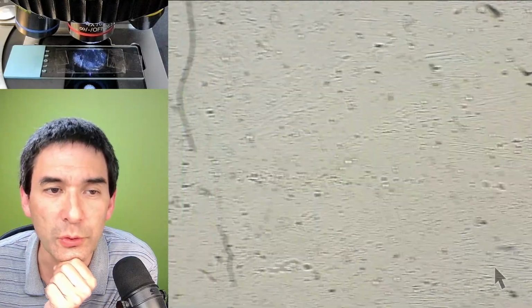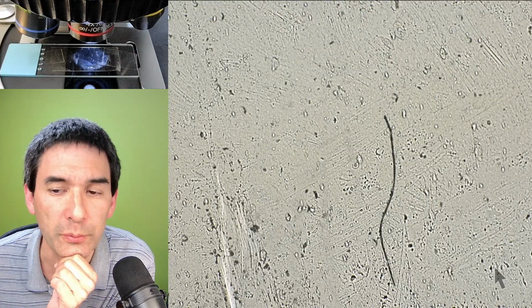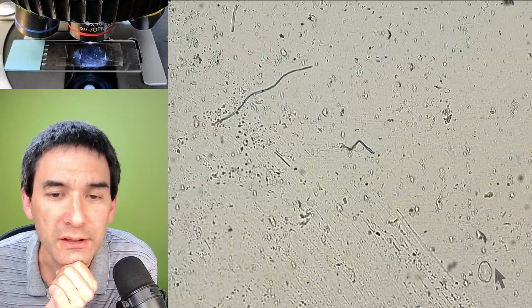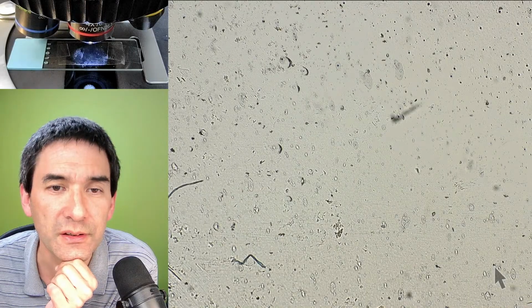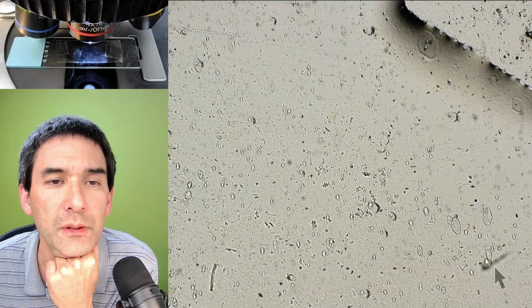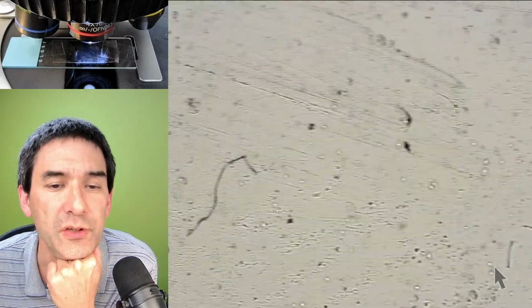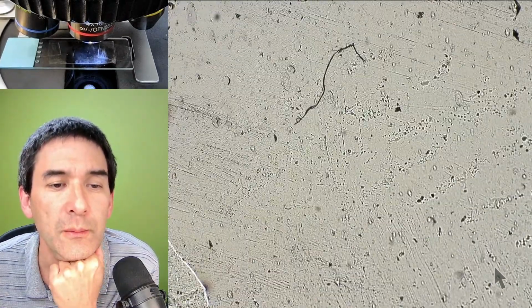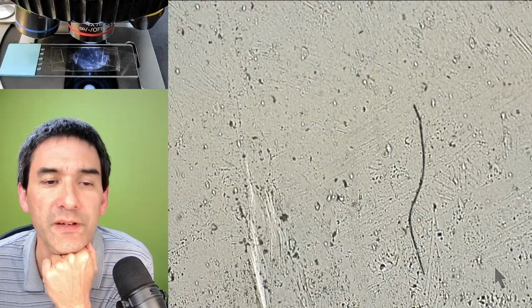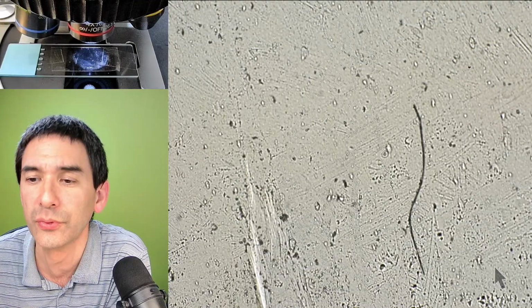And then in a minute or so, I'm going to read some of the comments again, because I just saw that somebody commented. Dave commented with UV activated resin to make a leaf peel. That's to make the surface of leaves visible. That's interesting, yeah. So every now and then we have to refocus. So as expected, I just wanted to show you, no face mites here. What I'm going to do now is move over to the other one, which does contain some face mites. But I'll do that after having quickly read through your comments.